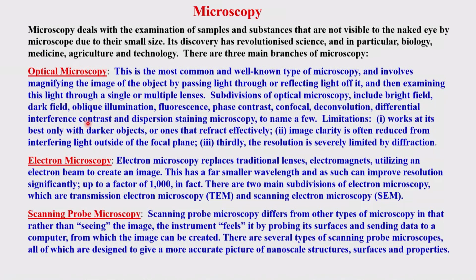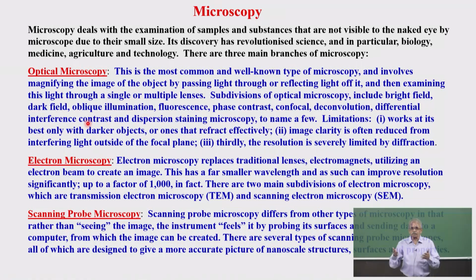Very similar analogous techniques have also come to electron microscopy. You will see some of those as we keep moving across this topic. But there are a huge number of limitations. One is that this can magnify only to a maximum of 100 to 1000 times, which means molecular-level, nanometric-level things cannot be visualized or imaged with these.